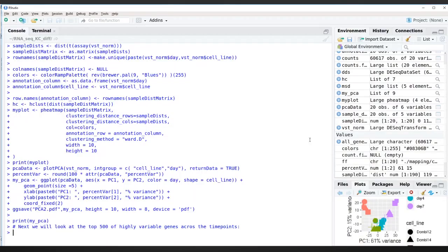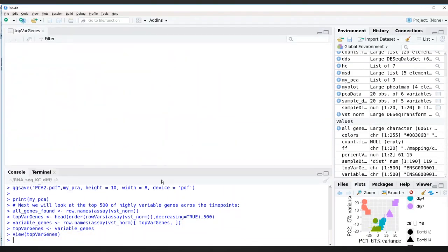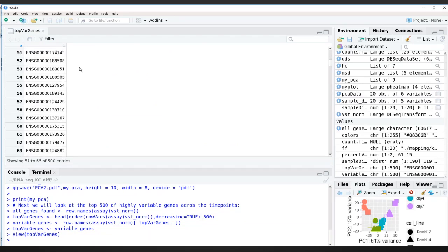The 2D in vitro differentiation method is straightforward and easy to perform. It can be used to study epidermal differentiation, especially when a large number of cells are necessary, for example, in epigenomic analysis. The detailed RNA-Seq analysis pipeline is clear and transparent for researchers with basic bioinformatics skills, and it can be used for any bulk RNA-Seq analysis.